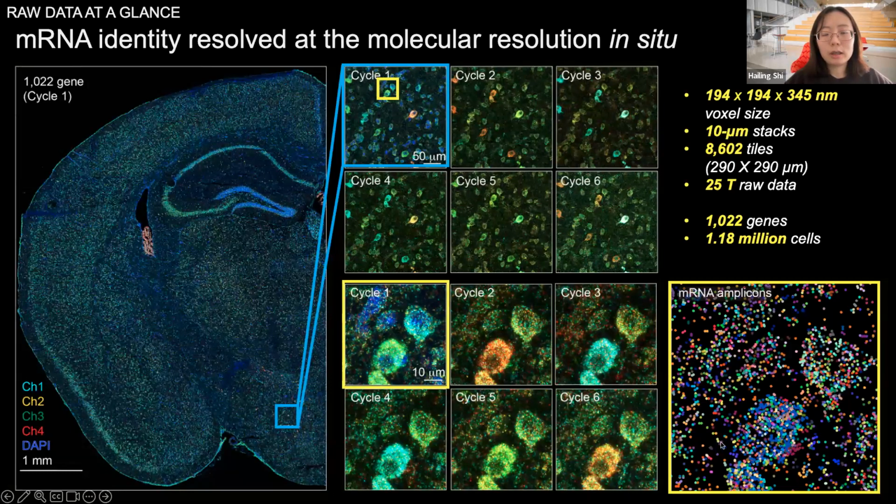So I do think expansion microscopy can help, especially if we want to look at intron signal or splicing events happening in densely packed nuclei. But otherwise, looking at cytosolic RNA is usually already okay without expansion. Expansion also comes with more imaging time. In the future, combining with spinning disk imaging will be a nice combination of time, cost, and RNA spot yield.